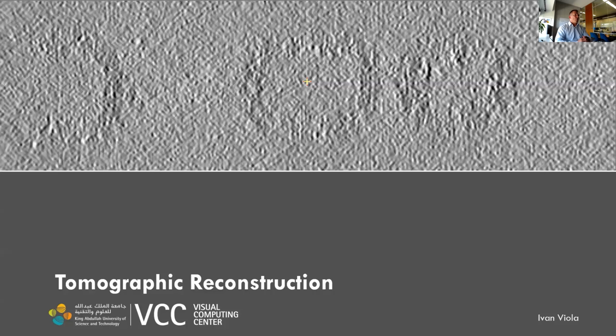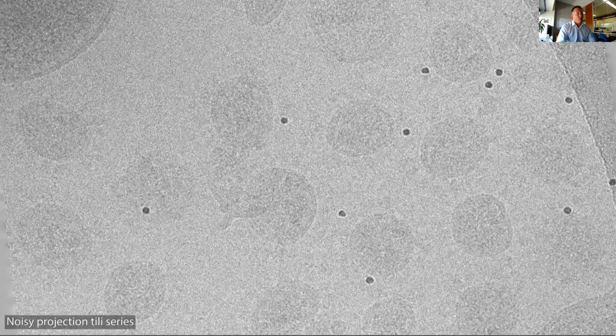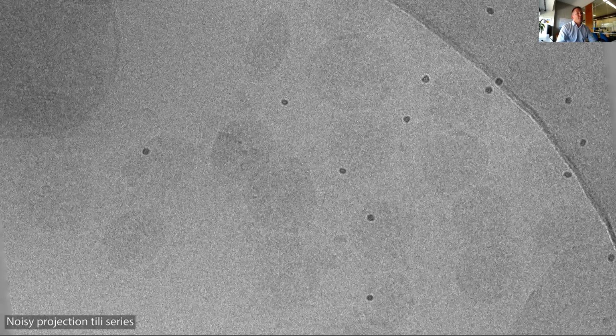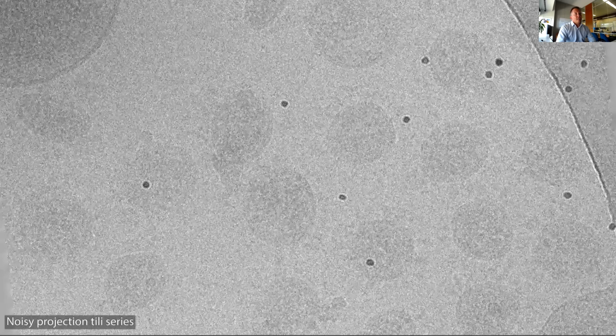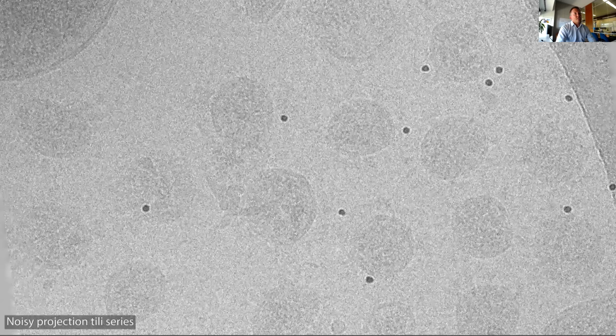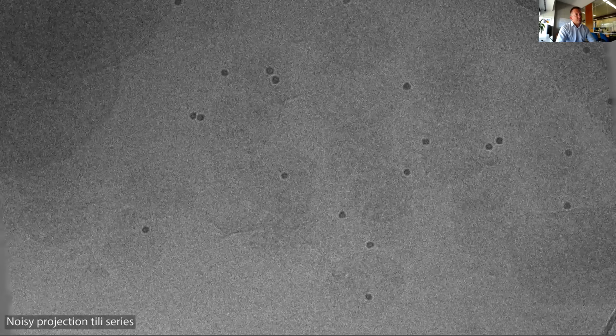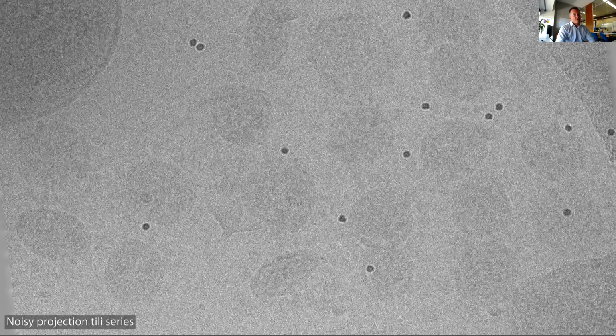Let's first talk about our work on tomographic reconstruction, or what is done in tomographic reconstruction in general, and then in particular in our case. You can see here, hopefully, the specimen which has been provided to us by Sai Li's team, which are the tilt series of the intact SARS-CoV-2 variant.